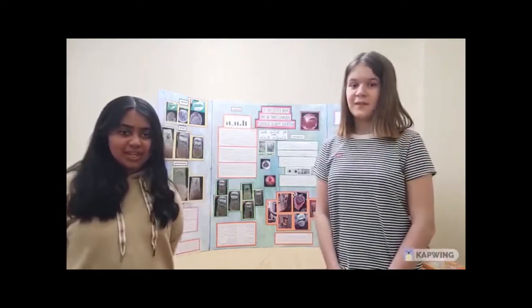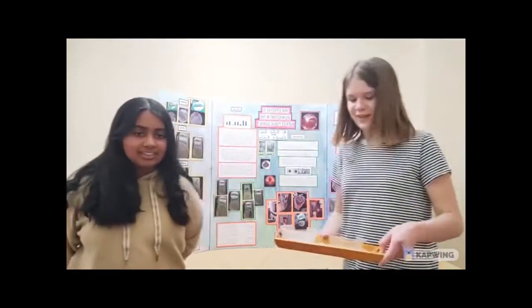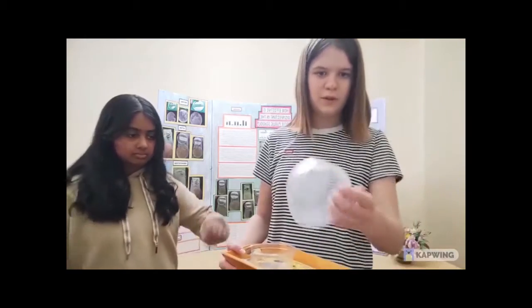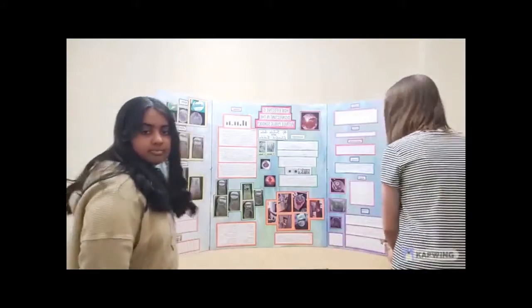Before our project began, we also learned how to create an incubator because we did not have a bacteriological incubator. This process was quite easy and I have to say fun. What we did was cut rectangles out from 2 yogurt containers. As you can see here, we have examples. This was a rectangle cut out, and this was this. One larger than the other, and put reflective tape on the larger container. I'm not sure you can see the reflective tape, but it's there. We then poked holes into the bottom of the smaller one, and 1 hole in the bottom of the top one for a thermometer. We then got a lamp and propped it up next to the incubator.